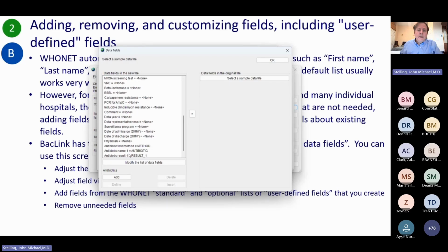At the bottom, you see physician, data representation. And then you can say a fixed value. If these are all healthy terrestrial land animals, you can just put that. If these are all the same physician, well, they wouldn't be, but you can put that in. And then you can map it to the values on the left. So let me go back to my PowerPoint.